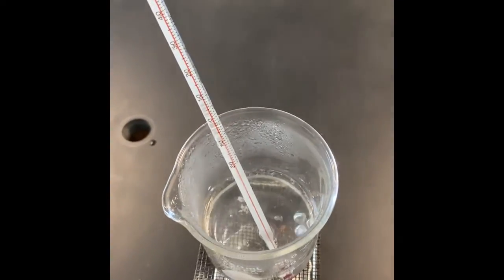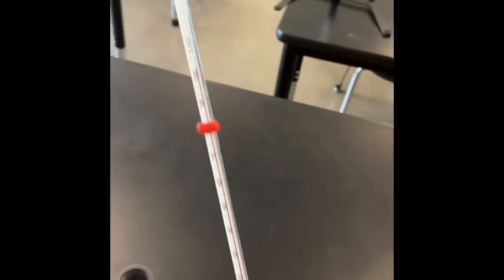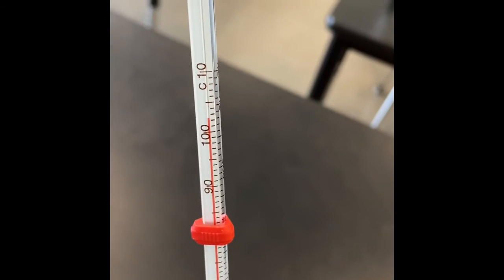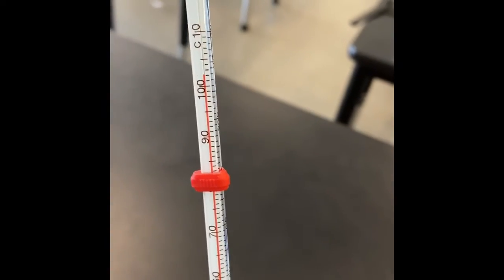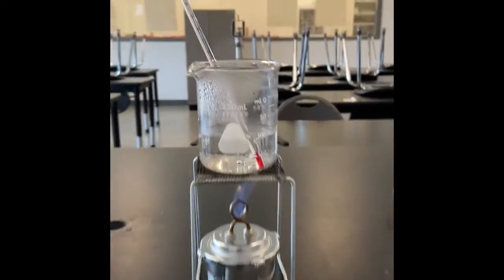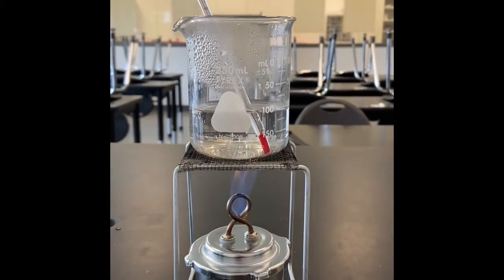The mixture looks fairly similar. It still looks like a clear boiling liquid. But if we look at the temperature up here, it's now reading, what is that, like 102, 103 degrees Celsius? The temperature has raised slightly from when we were boiling pure water. Go ahead and pause the video and write down, why do you think that is?